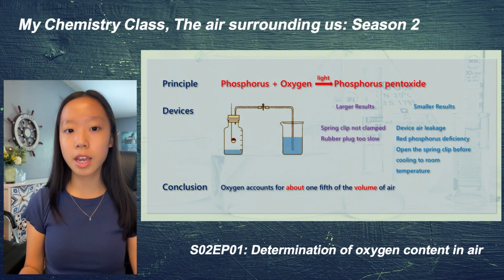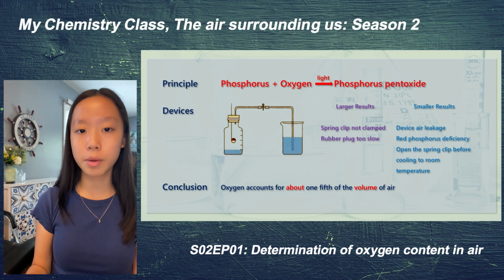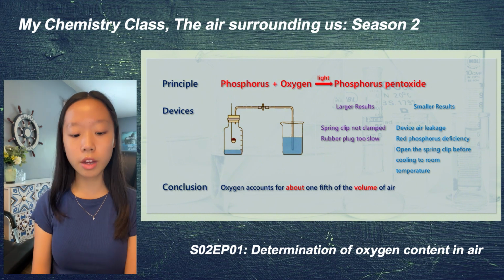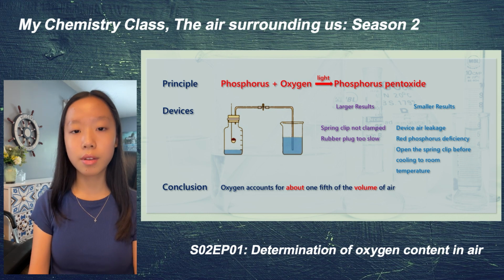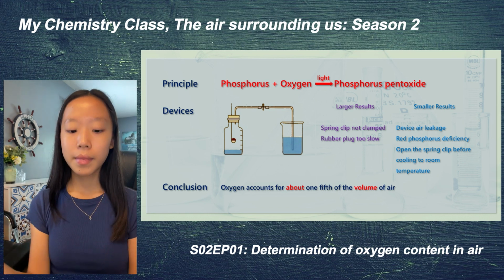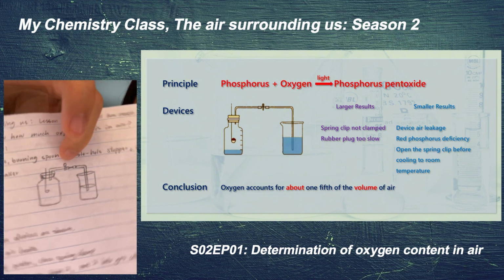for air leaks. And checking for any kind of leaks in any kind of experiment is super important because if there's any leaks, then the results of the experiment are not accurate and we cannot use them. So it's always super important to check for air leaks. And then step 3 is to add about half of the beaker of water into the beaker. And then we close the spring clamp, which is this little thing right here.